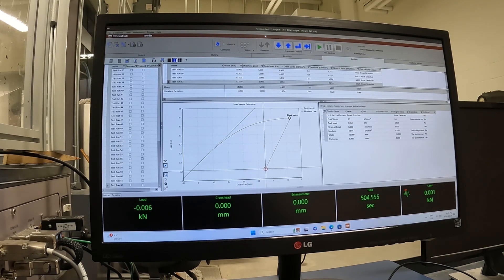This play button only shows up when I've locked the controller. If I unlock the controller, the display changes to the machine controller icon — the handset has exclusive control. If I lock the controller, it goes back to play. So now I'll hit run the test.